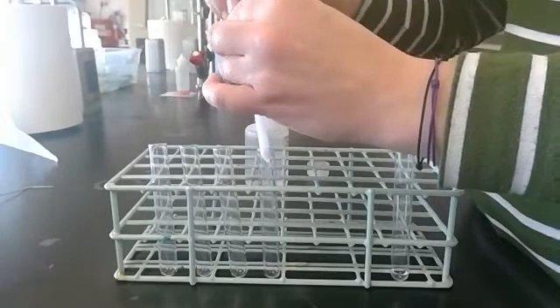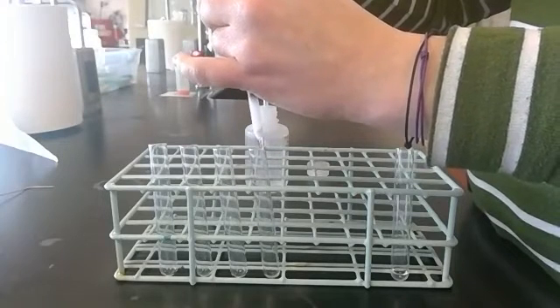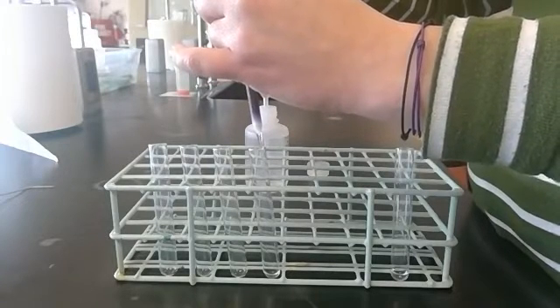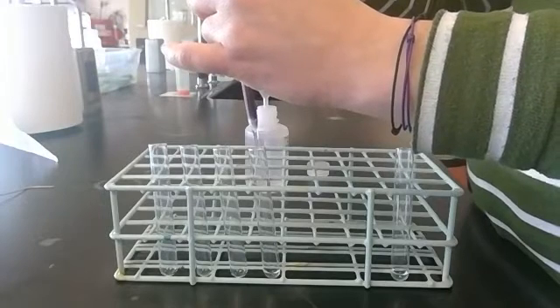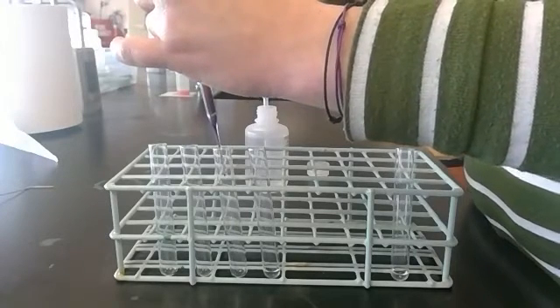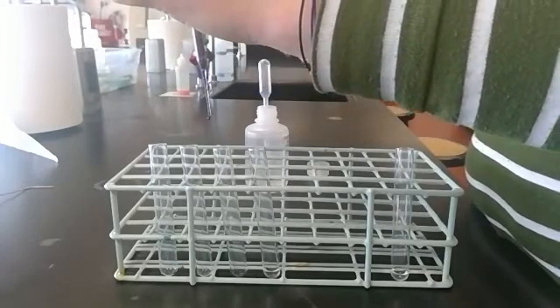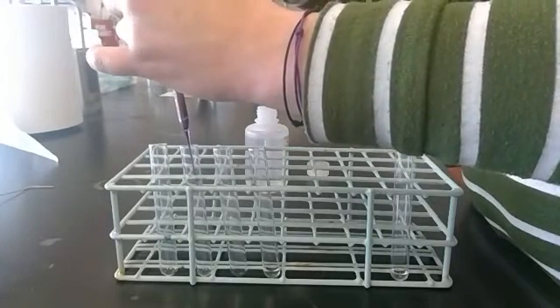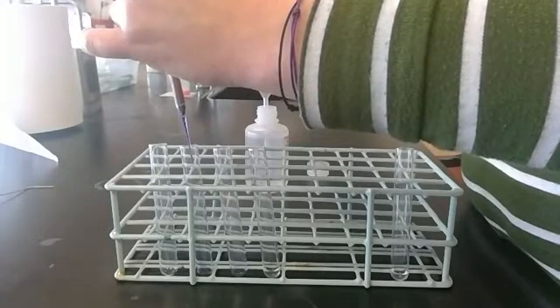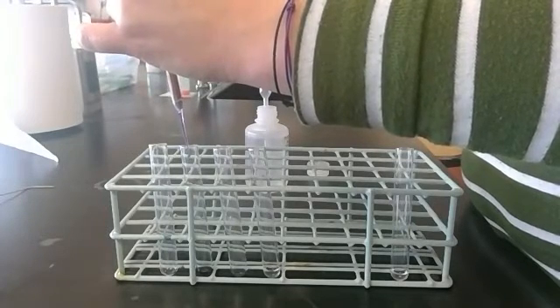I have lots of different test tubes here to allow me to collect different colored fractions. So right now, just clear is coming through. I'm starting to see the color come up. So I'm going to switch and collect. Now I'm going to switch and collect again because it looks like it's turning a slightly different shade of blue or purple. All right, I see it getting light again. So once I start to see this color change, it's very light now.